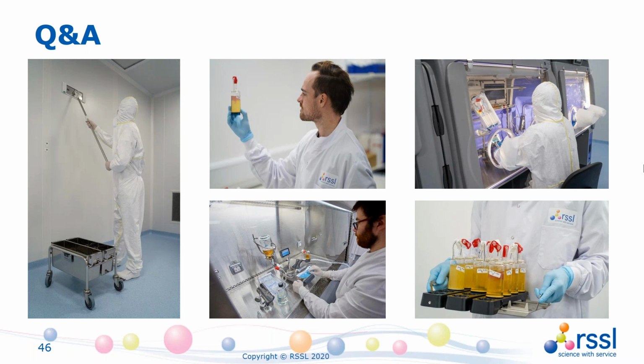Okay, and I think our time for one last question here. This is from Hannah. Do you have any recommendations for filtering foamy products? Foamy products are quite challenging. It's all about the membrane filtration pump speed, and you do need to go quite slowly, and this can take a bit of discipline on the person doing the sterility test, because they probably want to get it done fairly quickly and they're having to run it.